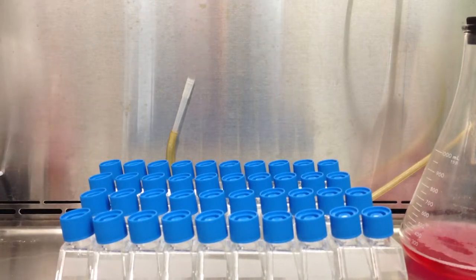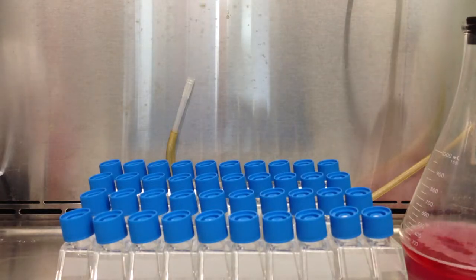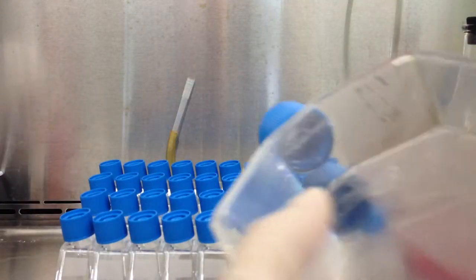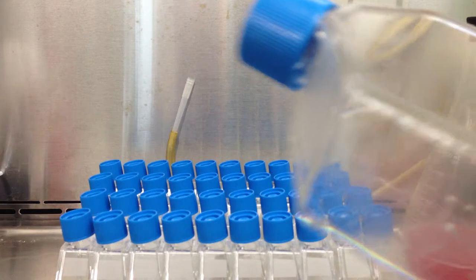I'm using D10. So again, here, and just hit the sides, and then, I can't show this part, but you want to try to get the trypsin to cover the layer again, and just hold up one of the flasks to the light, and you should see the cell layer sloughing off.